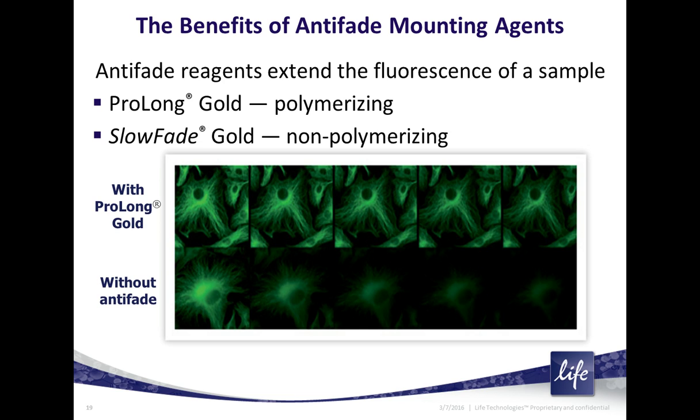Let me just take a real quick look at some of the questions here before I move on to controls. A long blocking period between antibodies? No, typically you only want a blocking step right at the beginning before you do any antibody staining. You don't need to do separate blocking in between.